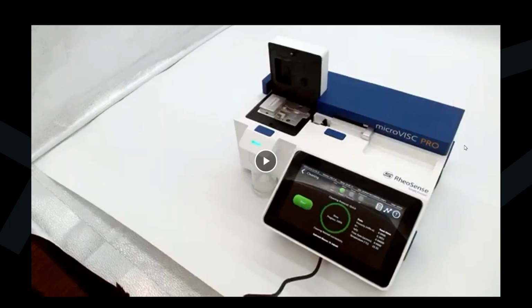If you have compatible samples, I mean, if you have different concentrations of one sample, then you can do continual measurements without cleaning the chip in between. For example, we can do intrinsic viscosity measurements with microVISC Pro, and for intrinsic viscosity, we have a series of concentrations which are in the dilute regime, so those are not very high concentration samples.